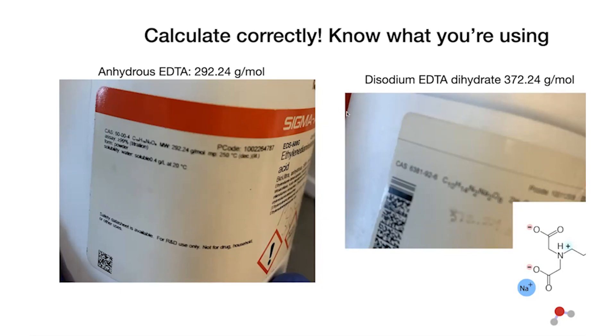The CAS number is a long number with dashes that serves as the unique chemical identifier for that molecule. Be careful about just Googling the name — if you Google 'what's the molecular weight of EDTA,' it might give you the molecular weight of the anhydrous form without water, when what you're really dealing with is disodium EDTA dihydrate. Using the CAS number gives you a better guarantee of finding the exact specific chemical you're looking for.